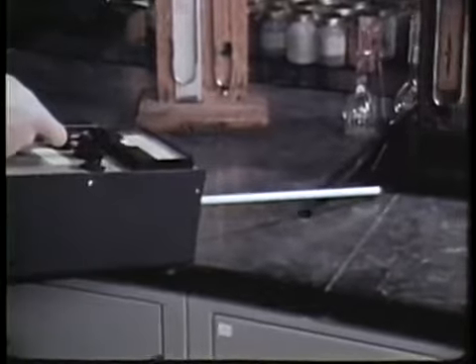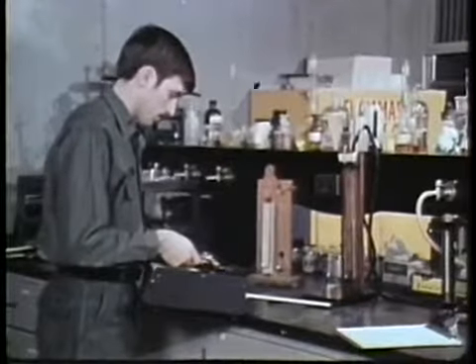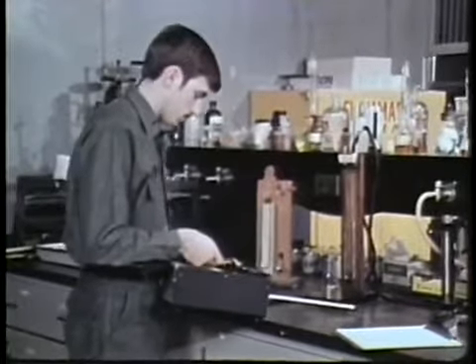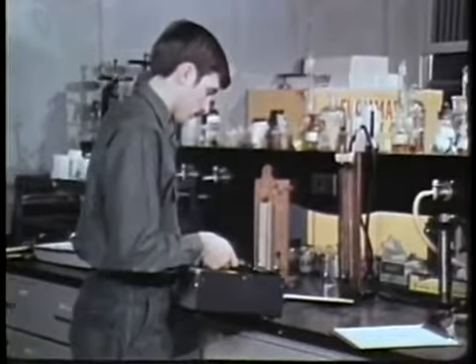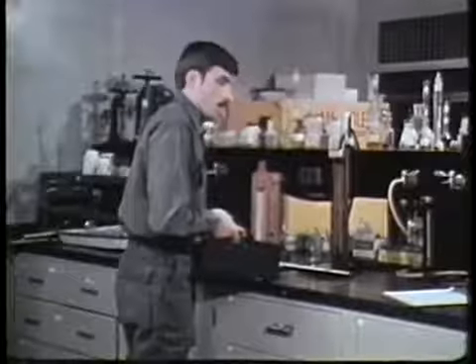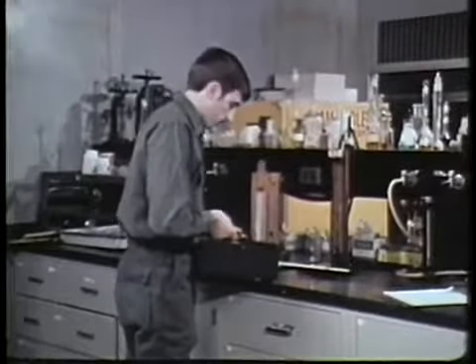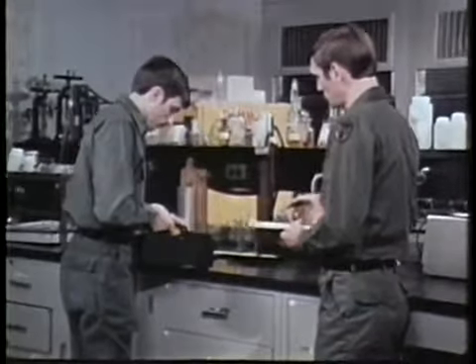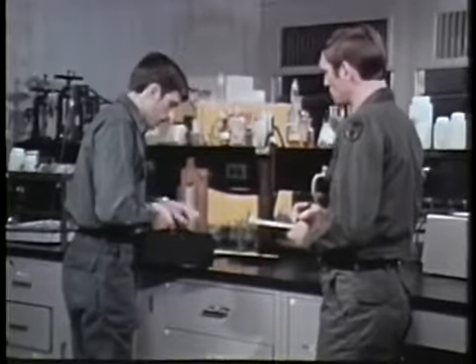Certain gases and vapors can interfere and cause erroneous readings with the mercury vapor detector. From your preliminary survey, you should know whether any of these can be expected. When you detect mercury vapor, allow the needle to stabilize and take a reading. Then shift to filtered air.